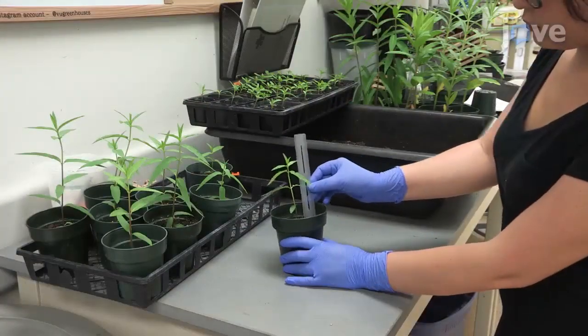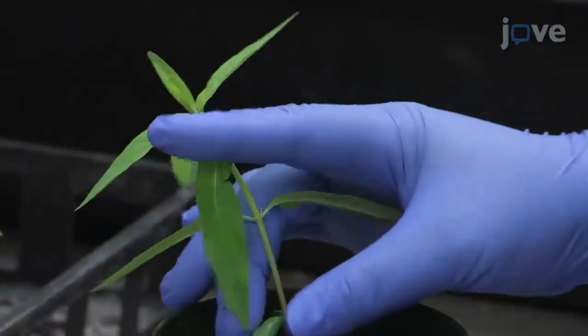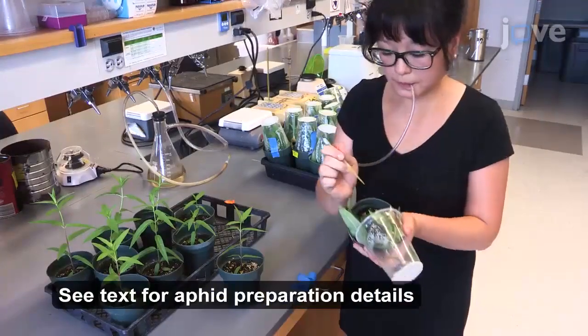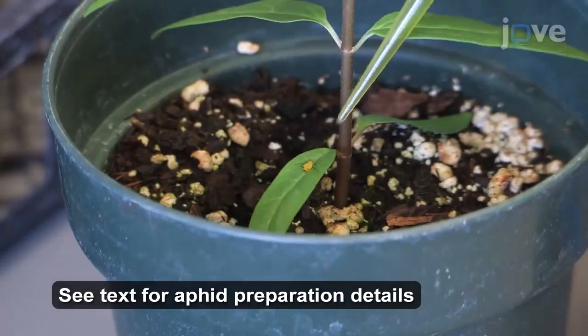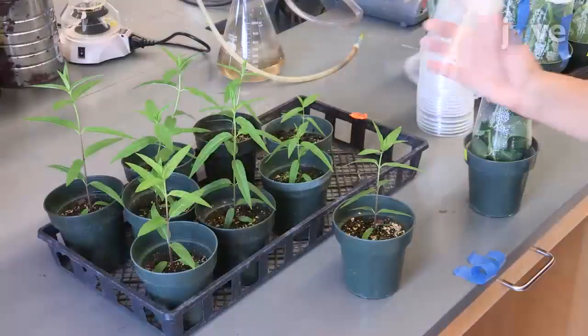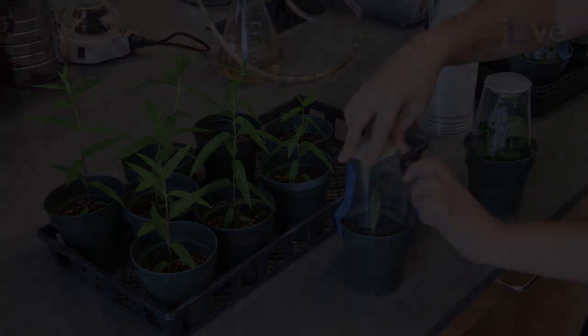When the plants have grown at least 3 to 4 sets of full leaves and are at least 10 cm tall, manually inspect the plants for any unwanted pests and use a mouth pipette to carefully transfer a single reproducing field-collected adult aphid onto the leaf of the first plant to create an isoclonal line. When all of the aphids have been transferred, securely cover the plants with a custom enclosure.